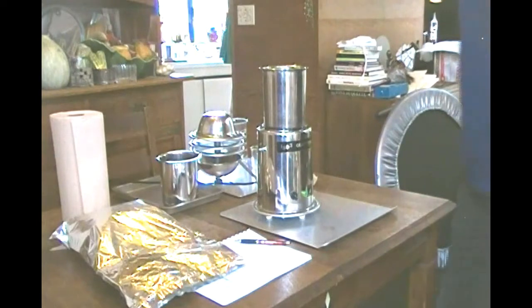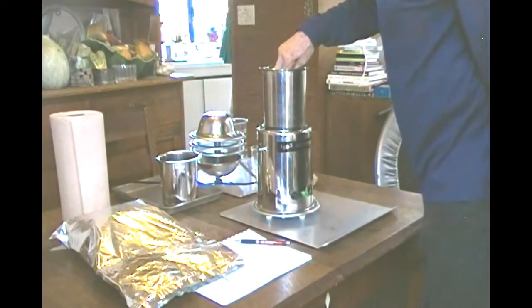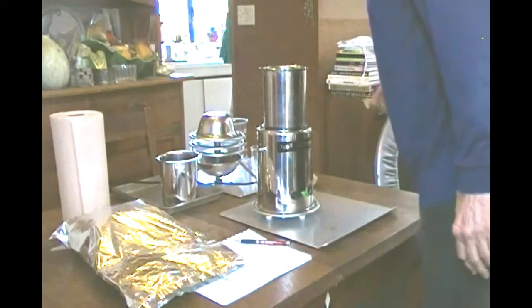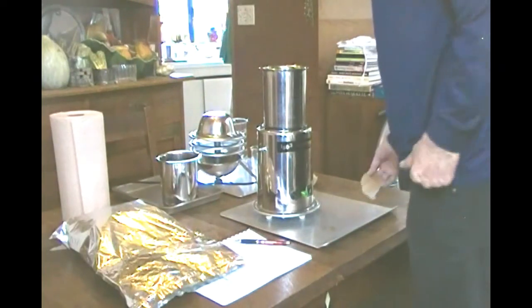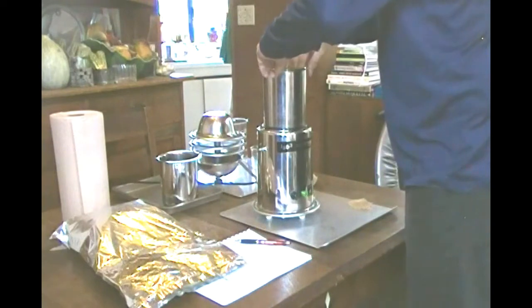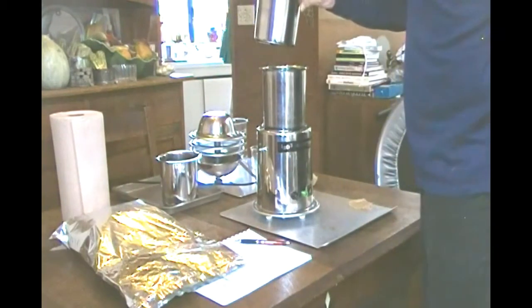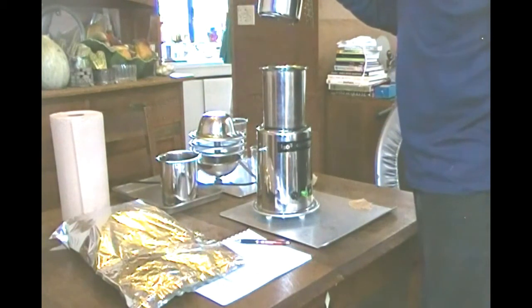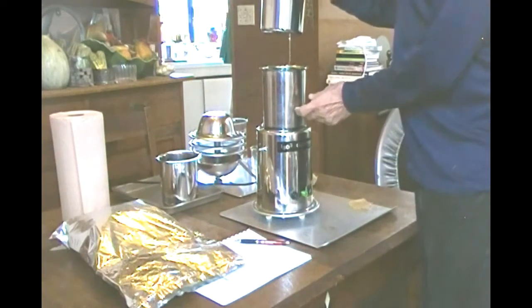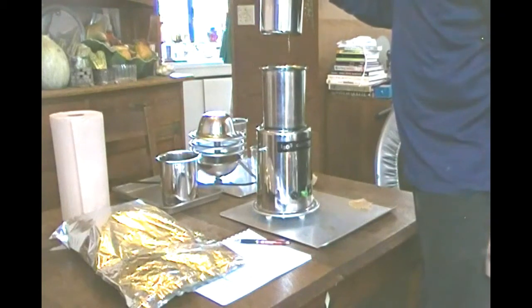Now we look in here and we check for our extraction. I lift out the spreader sheet, and I see that all of the hops flowers are now the color of light, bright yellow straw, which is what we want. Now we look under here, by lifting this up and turning it, we can see some drips coming out. Those drips are clear. The fact that the drips are clear indicates that everything that we wanted is down inside the processing vessel dissolved in alcohol.